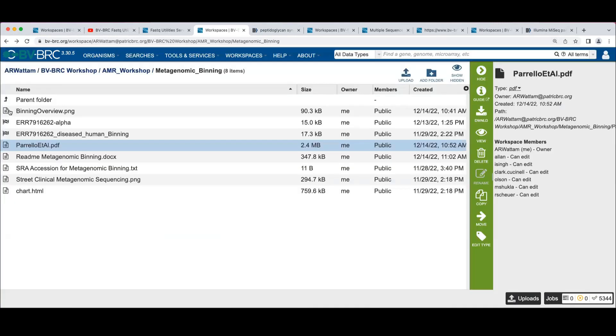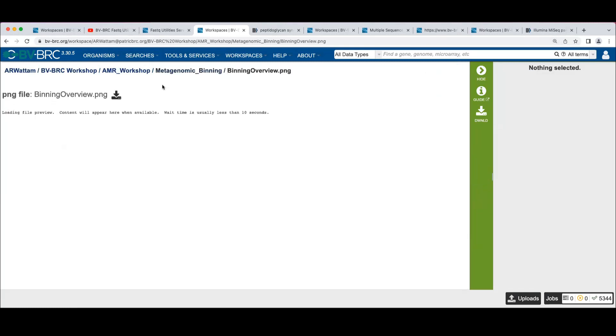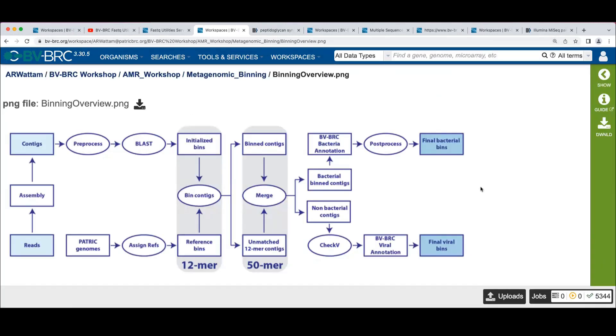The binning workflow starts with the set of reads, just like we've been doing with the rest of our tools. We assemble those using one of the metagenomic assemblers, either megahit or metaspades, depending on the input, to give us larger contigs to work with.